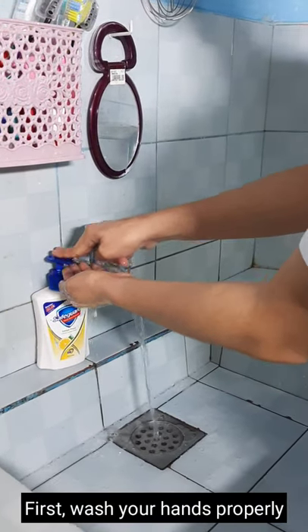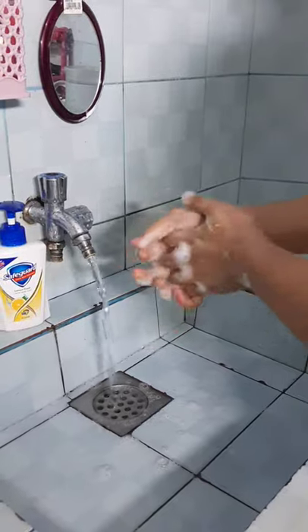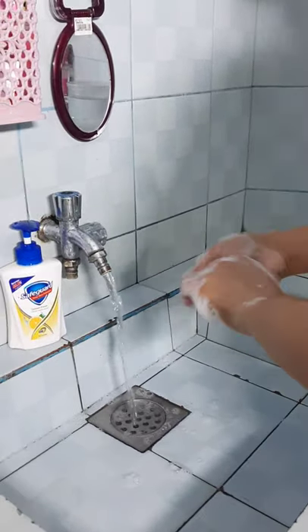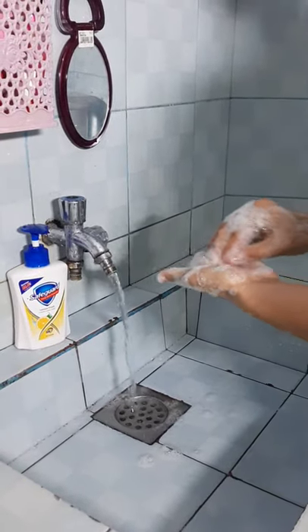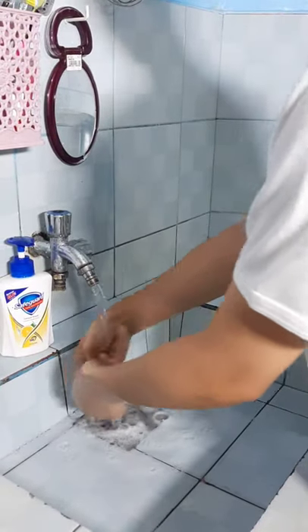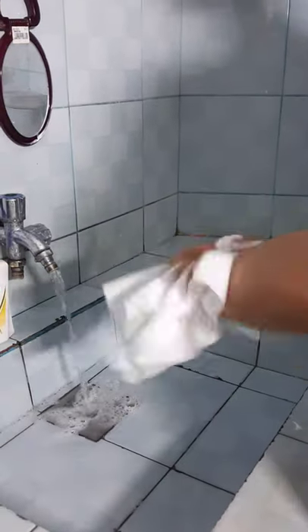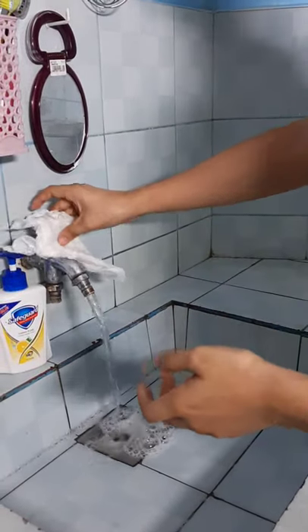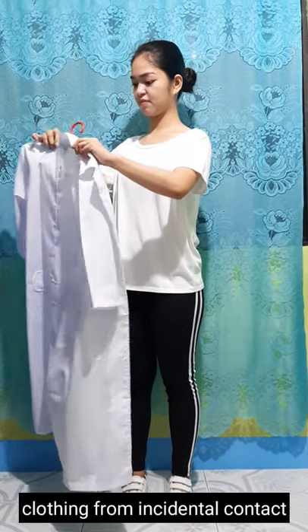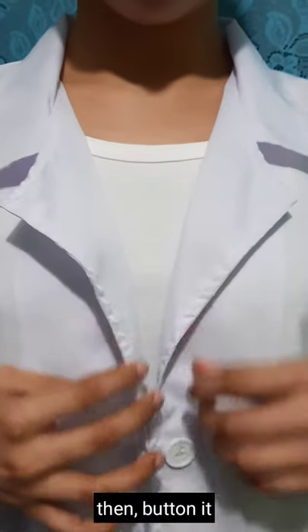First, wash your hands properly. Wear the lab gown to protect the skin and personal clothing from incidental contact and small splashes. Then, button it.